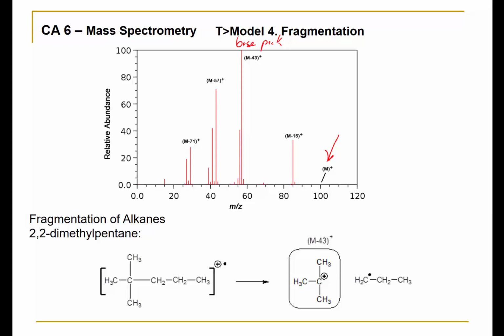When we look at the structure of the molecular ion and we speculate, well, what gave rise to that base peak, I hope it's clear to you that essentially this bond was severed. So in other words, there would have been a single electron between those two carbons. The electron went with this particular radical. Now that would be the loss of a 43.